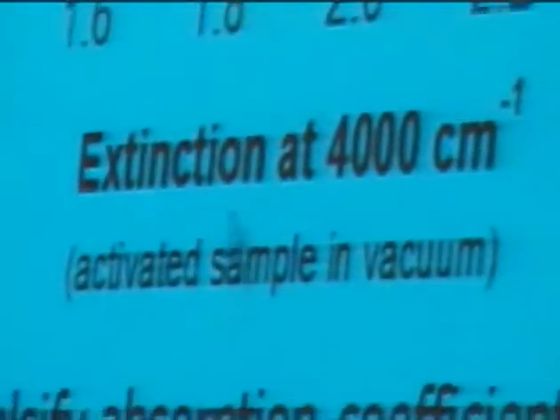And so we were wondering whether there's a relation between the absorption coefficient that we observe, apparently, and the scattering ability of the wafers. Now, one way to assess the scattering ability of a specimen is just to take the absorbance value in a region where you do not have any discrete bands, where it's surely just created by scattering. And then we made an overall plot of all the absorption coefficients that we had measured for an entire set of samples of sulfated zirconias and zeolites, and plotted this versus the extinction. I call it that because the light's not really absorbed, it's scattered, and that's the reason why it doesn't reach the detector. And you got this relation.